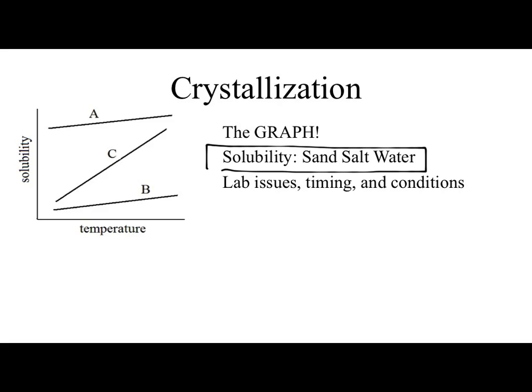Okay, I can give you the easiest first step. You probably obtained some crystals. Then what'd you do? Okay, you could set up a filtration system, but to filter something, what do you need? You need a liquid and a solid to be able to filter something away from. At this point, all we've got are crystals. So what did you need to do? We need to mix it with a solvent. What's the goal of mixing it with the solvent?